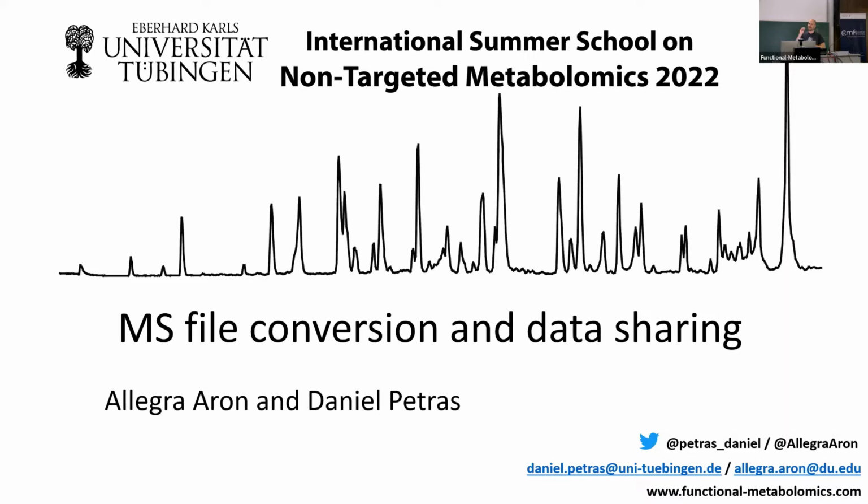Most important, and that is perhaps the big take-home message: I know sometimes there are troubles with IRBs and patient data, but if that is not a concern and you're able to make the data public, please make it public. I think that in other communities this is completely standard. Metabolomics, I think, is in part still a little bit behind, but to make data accessible and reusable by others is quite important. So please make your data public.